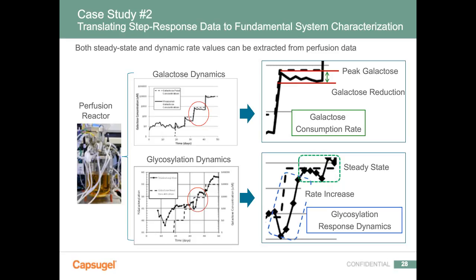The idea here is that we're looking at how to do development in more novel ways. Being able to do automated analysis allowed for this new approach where every 3 or 4 days we can change a parameter and see a result, instead of that batch process: make lots of changes, run something, wait. It's dramatically reducing your overall development time. And this is just one example of a way that you can change your entire approach to how you do development by having this automated system.